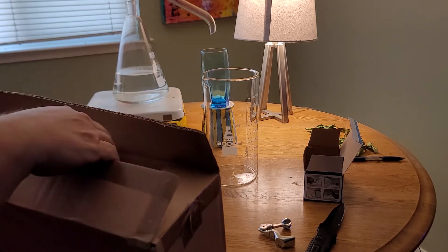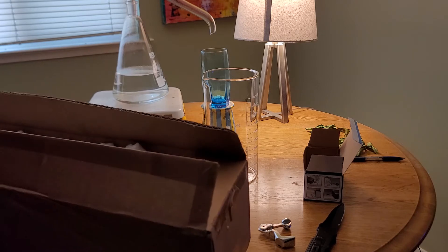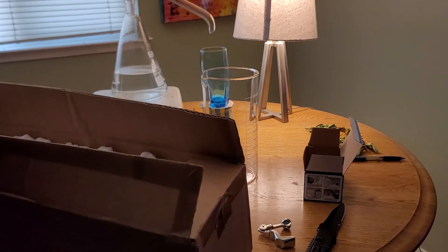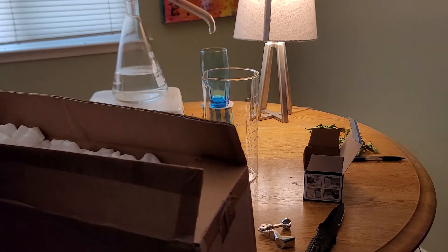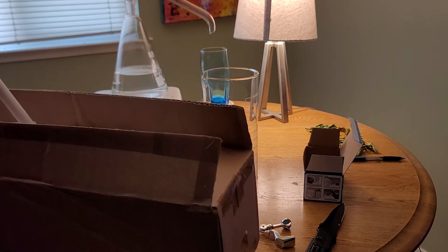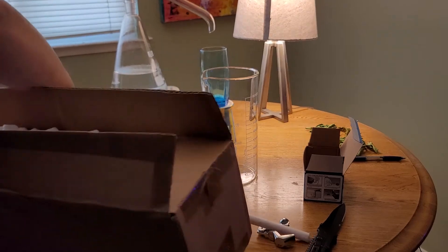And we got styrofoam peanuts here. This box was ordered from Amazon.com from Avogadro's laboratory supply.